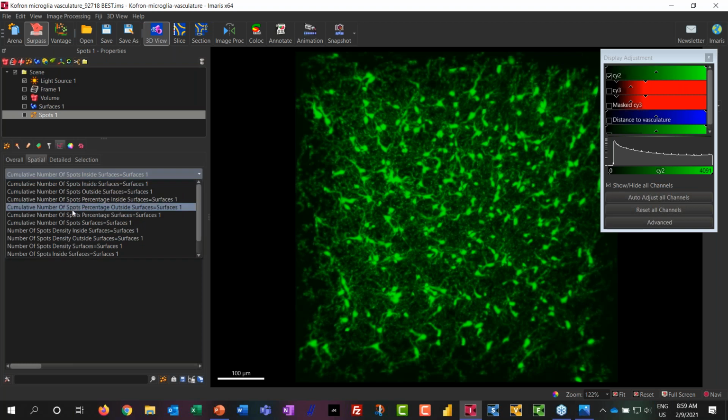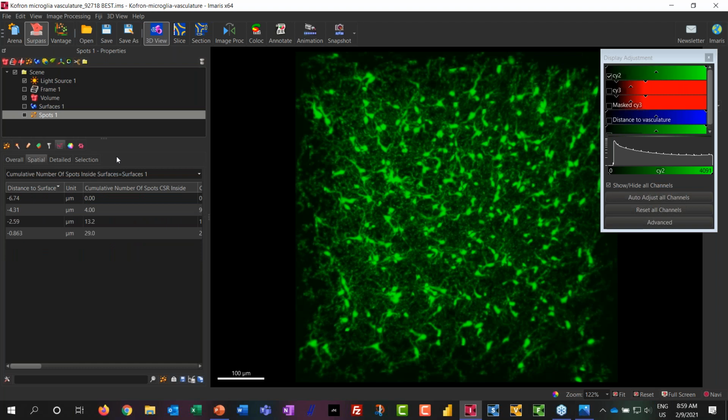We had one recurring question as well. Can you load two datasets and compare them in the spatial view plot? Let's say two different options, like control and a sample. There are some different ways of doing this, and I think that is something we should make a tutorial about.